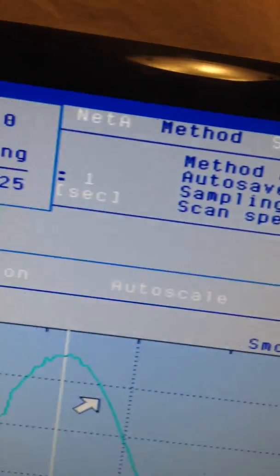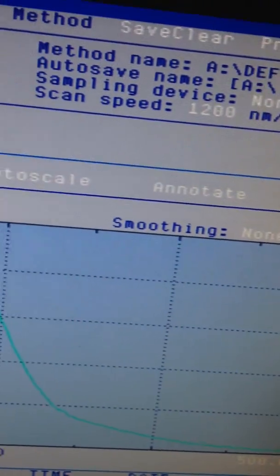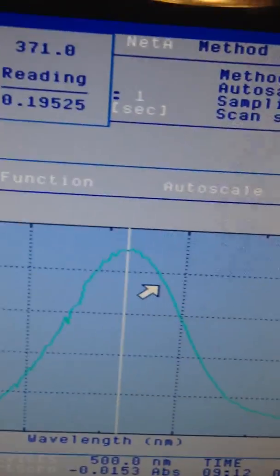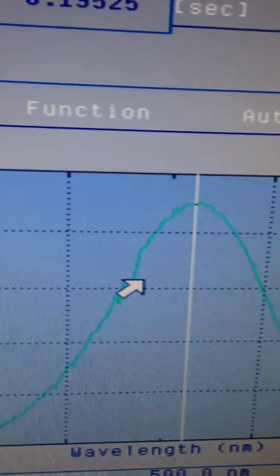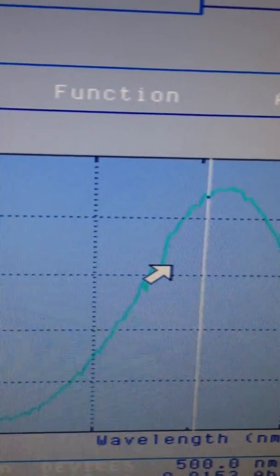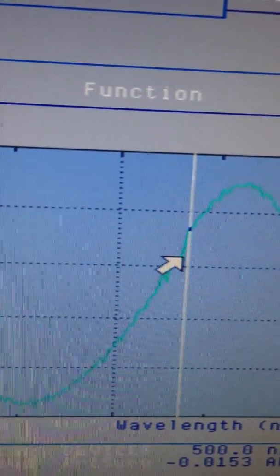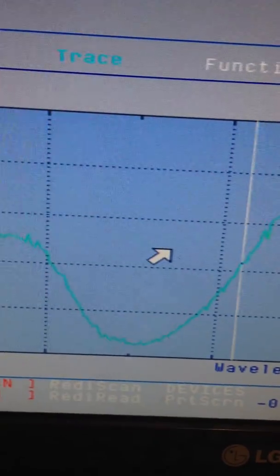If you left click, your trace will move to the other peaks. You can do many things in here.